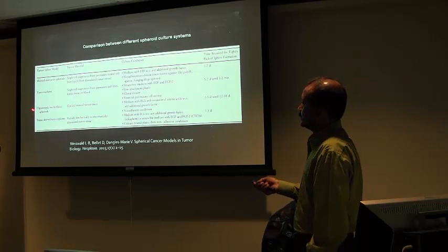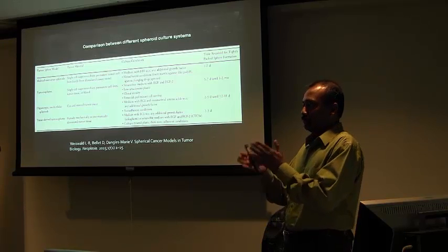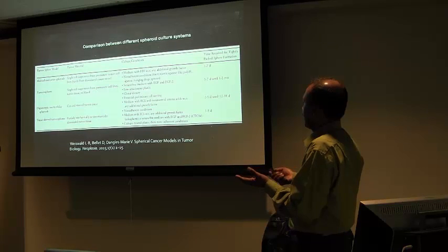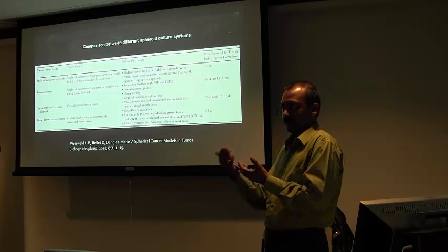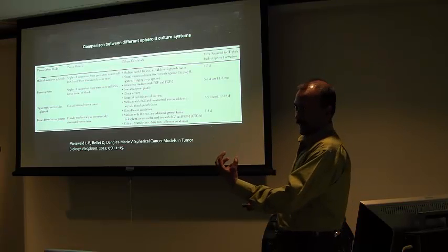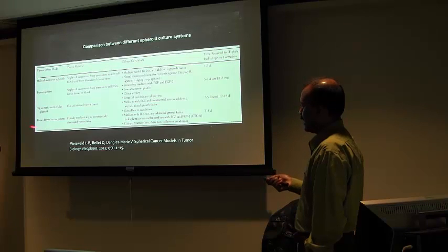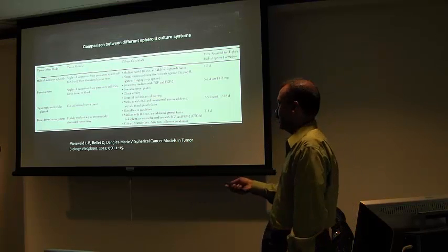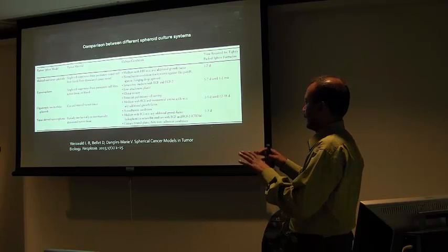Then you have organotypic multicellular spheroids, where you get the tumor lesion. It has all kinds of cells. You mince it up and make it a single cell suspension, and then you induce them to grow in a spheroid, having all different sorts of cells like fibroblasts or endothelial cells, whatever is there with the tumor cells. So they resemble the parent organ from where they're coming. So they're called organotypic multicellular spheroids. This is almost the same as tissue-derived tumor spheres. The only difference is here they have the clonal expansion like here. So these are 4 different kinds of spheroids that people have described so far.